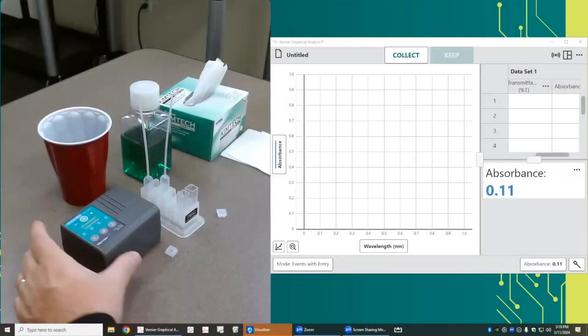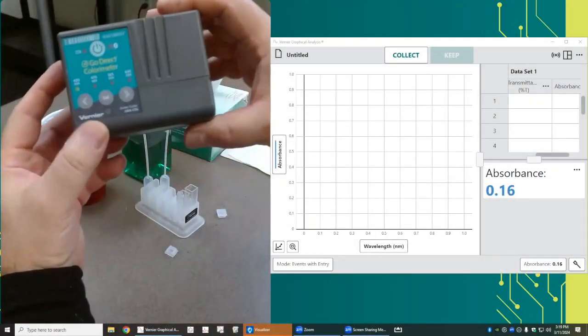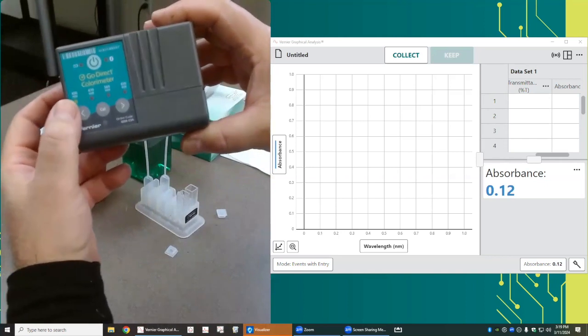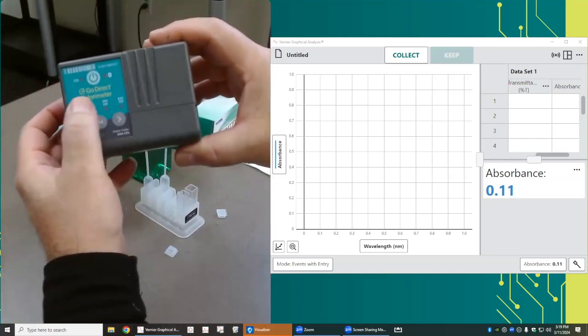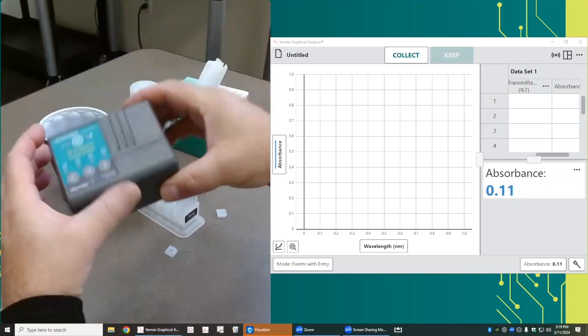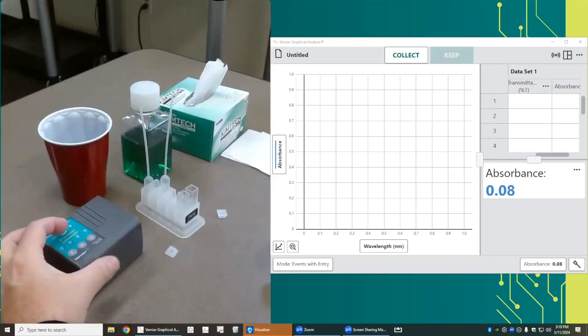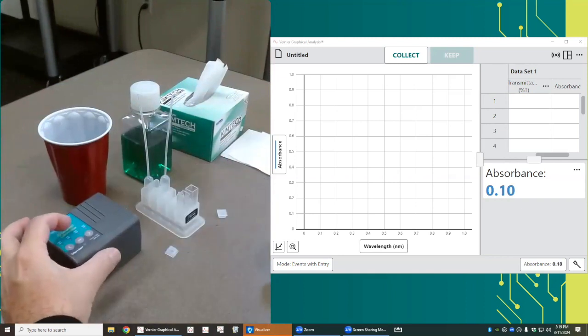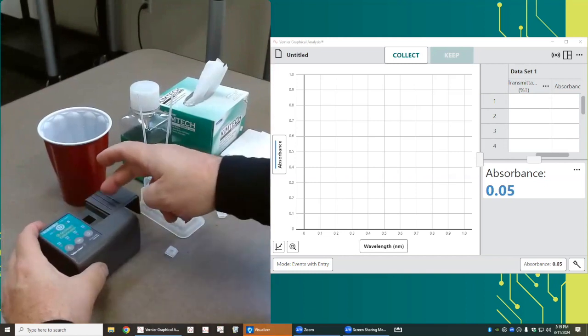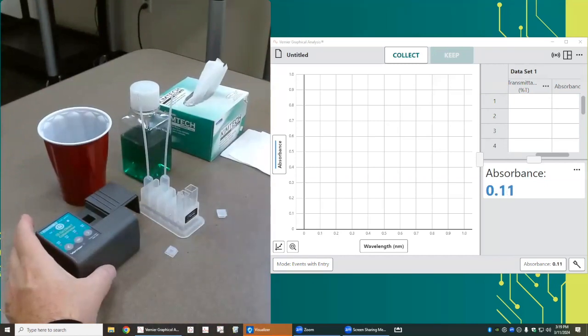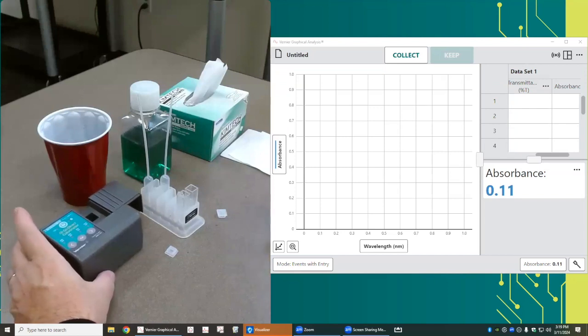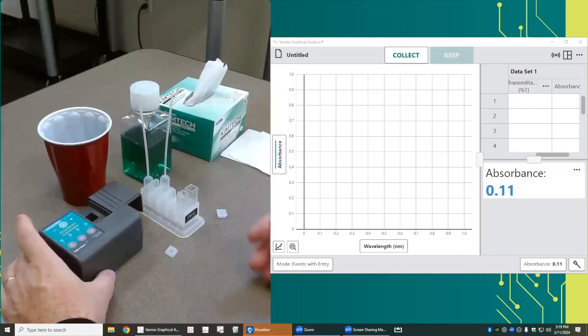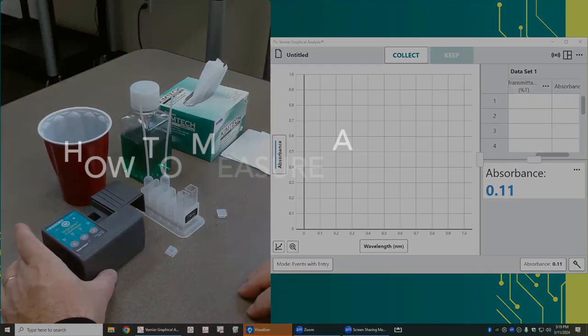The colorimeter has four LEDs that create four different colors. The light shines from the LED through a cuvette, and when the light passes through the cuvette to the detector, the detector measures how much light actually passes through the cuvette. Then the software calculates how much of that light was absorbed by the solution.